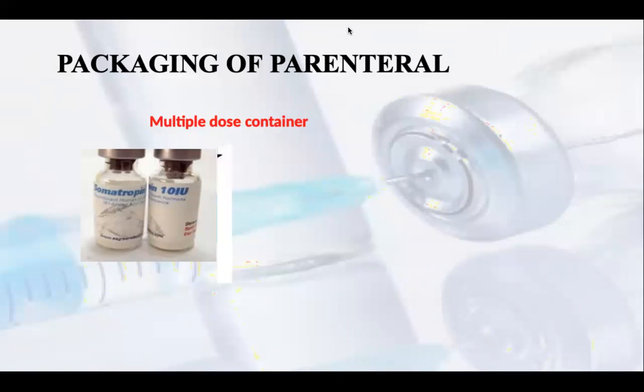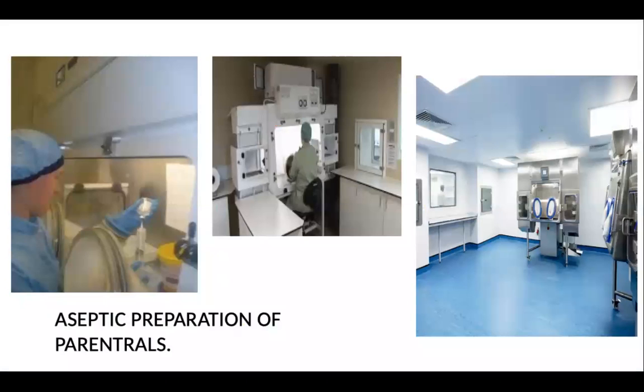Now, in a good hospital, in a tertiary care or quaternary hospital, these are all filled and reconstituted in aseptic conditions. Most departments have aseptic rooms. They have various devices. A laminar hood is there just to minimize the chances of contamination, so that when the drugs are reconstituted, they are not contaminated. So you can see how the people are filling the injectables in that aseptic area. Many devices are available in that aseptic area.